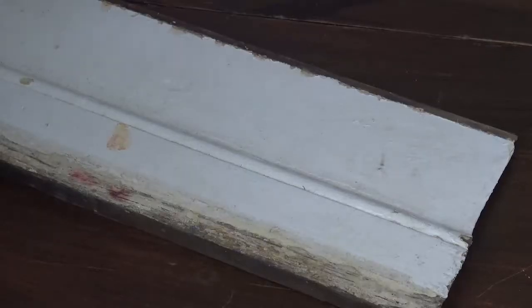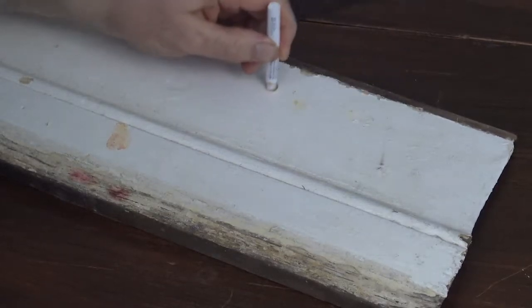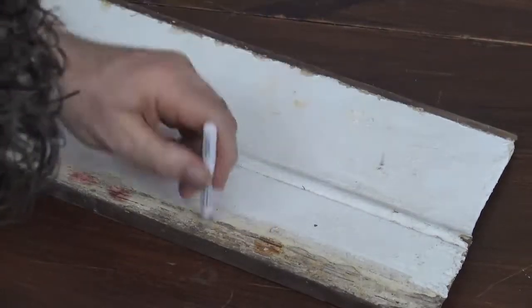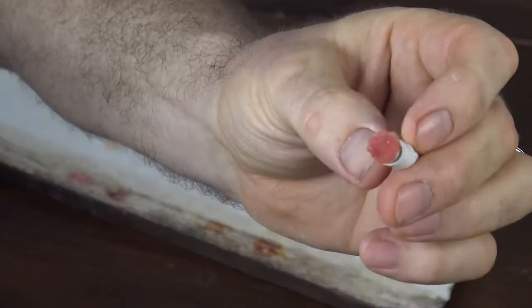I wanted to give you an example of what it looks like when you get a positive lead test. In this area I'm still orange, but in this area I believe I have lead. And there we go — if it turns red, you've got lead.